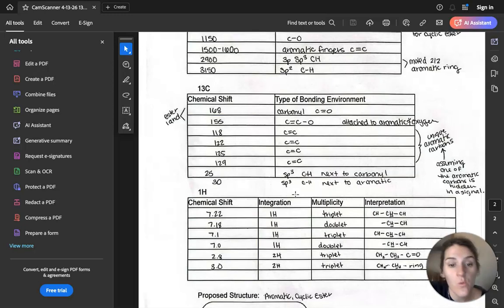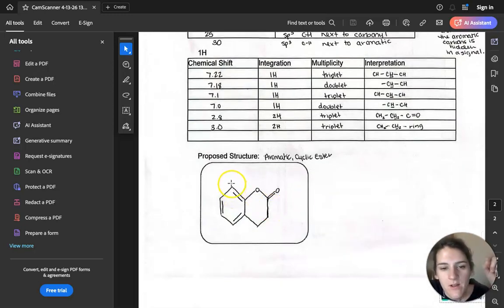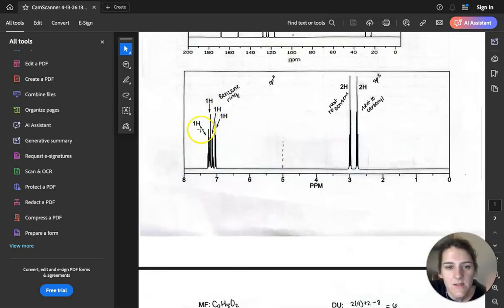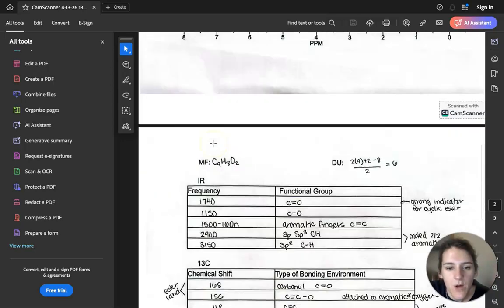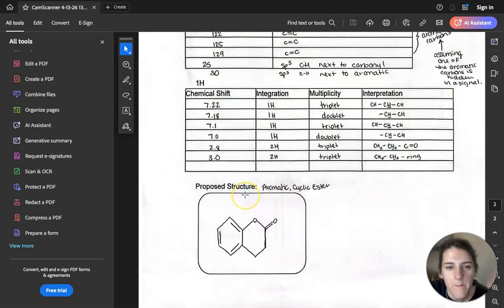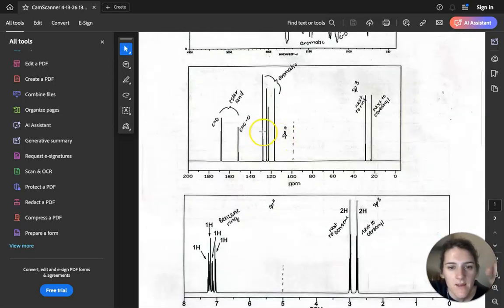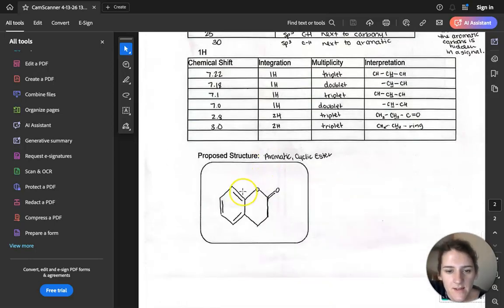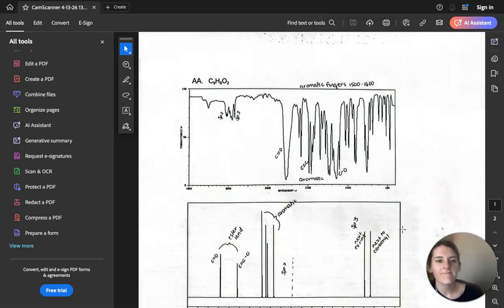Oh, actually, a little thing. We got one hydrogen here, one hydrogen here, one hydrogen here, one hydrogen here. For these, this is all correct. There's nothing hidden in here because there are no hydrogens on these two carbons right here. But I still think there is a signal hidden right here for the aromatic carbon, because all of these are unique carbons. Anyways, I hope you enjoyed. Thank you very much.